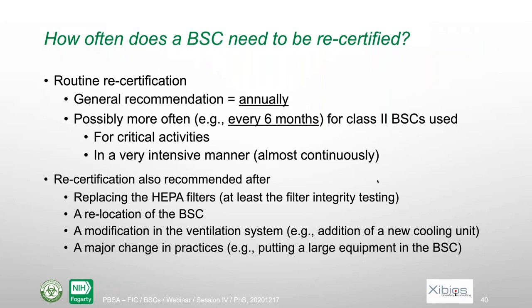The first question is, how often does a biosafety cabinet need to be recertified? The normal rule is every year. In some institutions, they even do it every 6 months because they consider that they have critical activities with a very, very high risk, for instance, or critical from a product protection point of view. Or they use the biosafety cabinets in a very intensive manner. For instance, there are people working almost continuously with the biosafety cabinet. In that case, some institutions do it every 6 months.